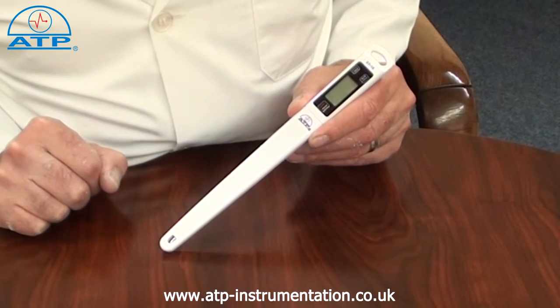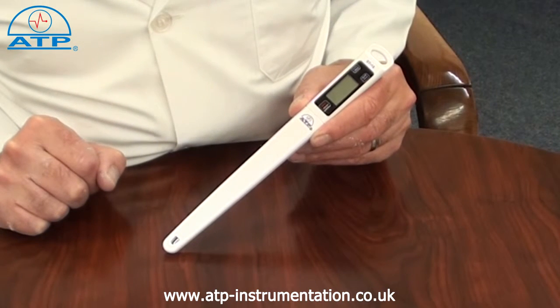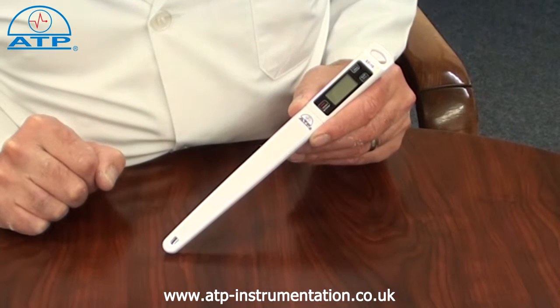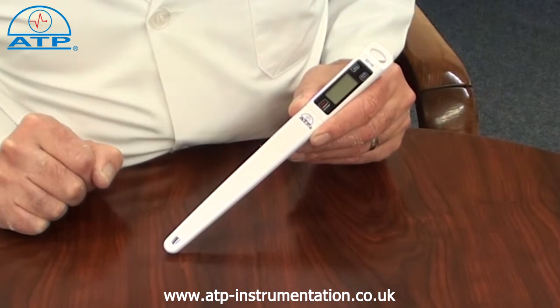It has a measurement range from minus 50 degrees to 330 degrees C, with a resolution of 0.1 degree and an accuracy of plus or minus 1 degree C. Readings can also be displayed in degrees F.